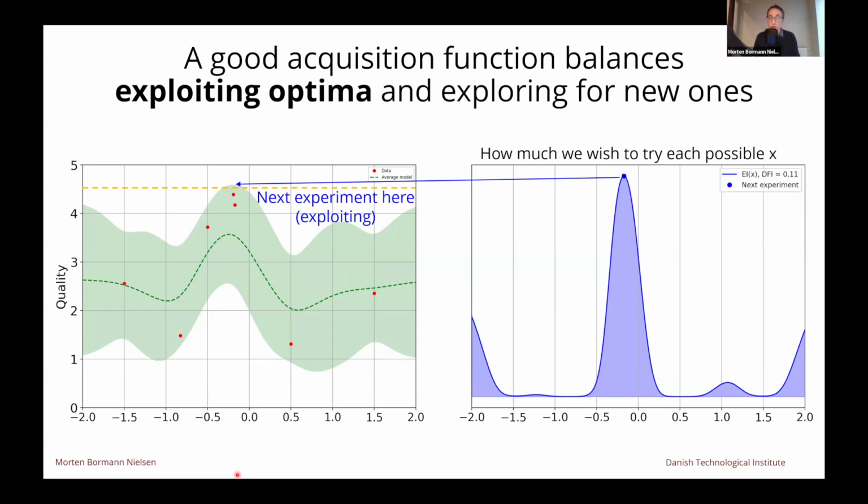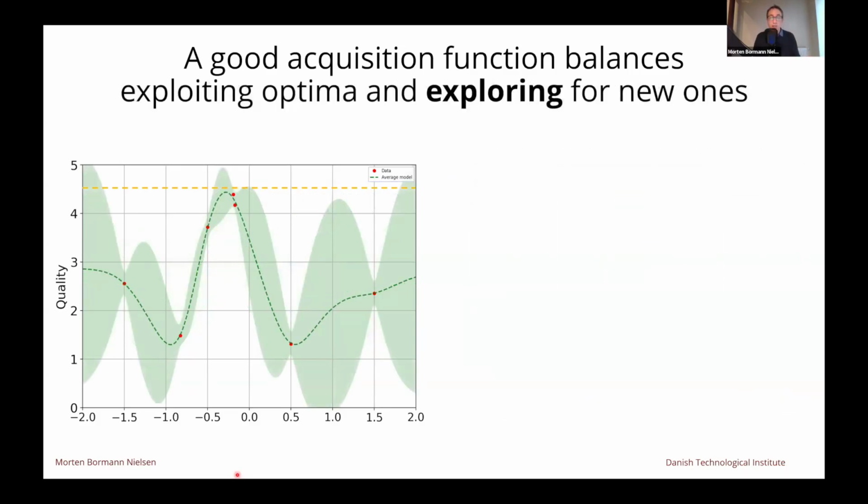And this means that this data point contains a lot of information about the noise of the system. Again, because the landscape has to be smooth, it can change relatively steeply, but it has to be smooth to a relatively large degree. So in this case, we have probably found one local optimum here at least, because down here and down here, the quality is low, and in here, the quality is high. And if our assumption of a smoothly changing landscape is true, that means that the underlying landscape has to peak somewhere in this region here and then go down again on either side.